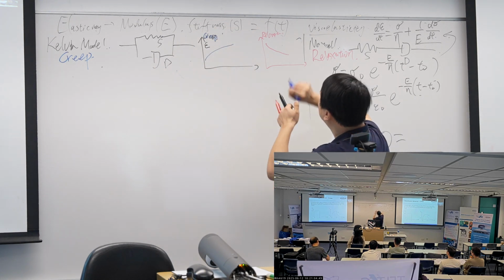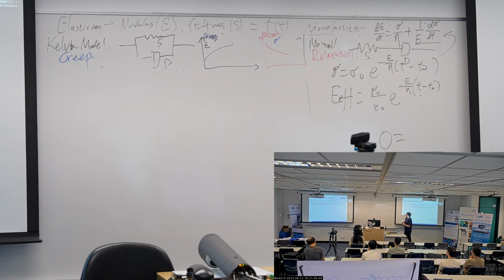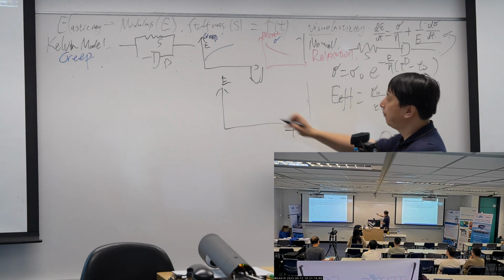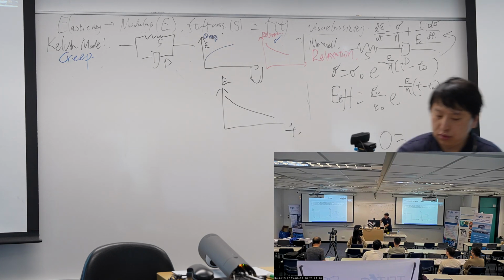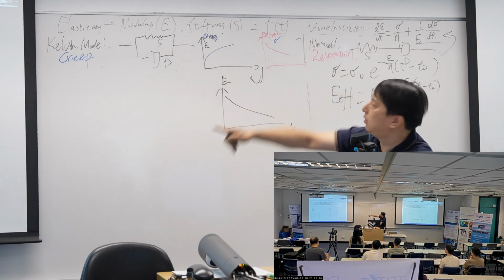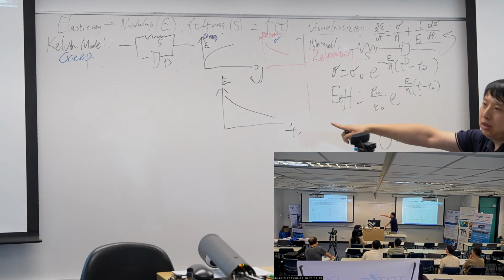This is the force. Either way, it can work, and then their final result is to get the modulus change against time. In the pure Maxwell, it should be something like this, and in the pure Kelvin, it should be the function I just erased. But nowadays, people just use the test results to help them decide what it should look like.